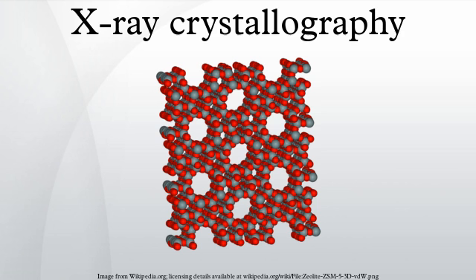X-rays are used to produce the diffraction pattern because their wavelength λ is typically the same order of magnitude as the spacing d between planes in the crystal. In principle, any wave impinging on a regular array of scatterers produces diffraction, as predicted first by Francesco Maria Grimaldi in 1665. To produce significant diffraction, the spacing between the scatterers and the wavelength of the impinging wave should be similar in size. For illustration, the diffraction of sunlight through a bird's feather was first reported by James Gregory in the later 17th century. The first artificial diffraction gratings for visible light were constructed by David Rittenhouse in 1787, and Joseph von Fraunhofer in 1821.